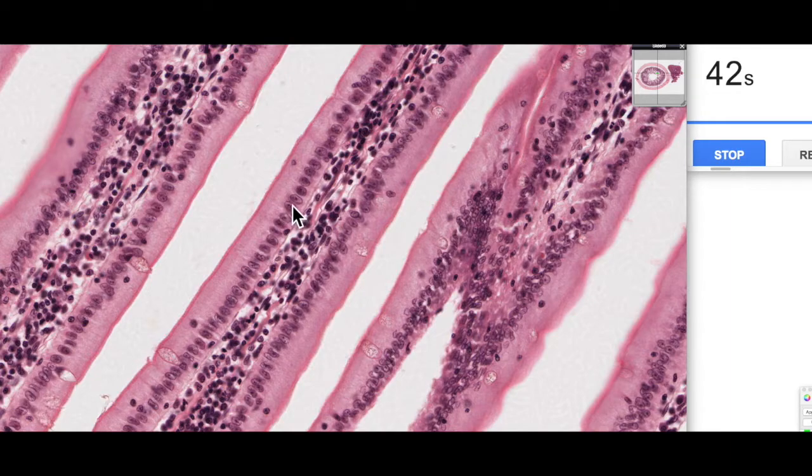You can see here we've got some very dark basophilic nuclei. These are different cell types within the underlying loose connective tissue. We've got our simple columnar epithelium here.